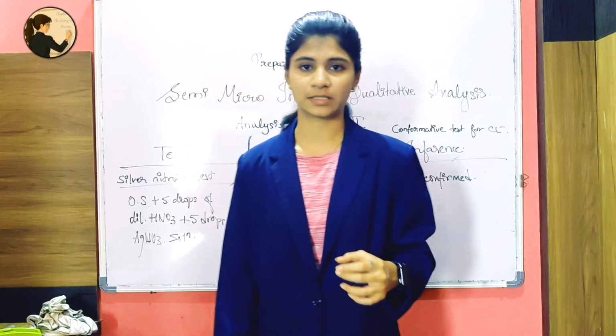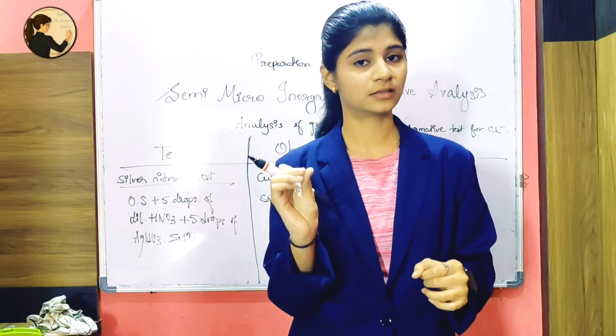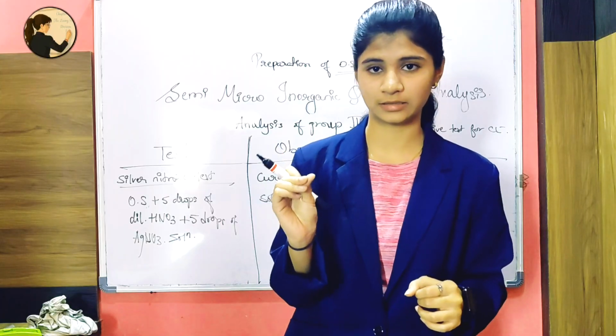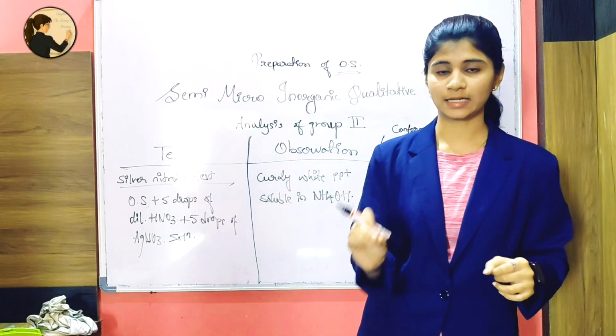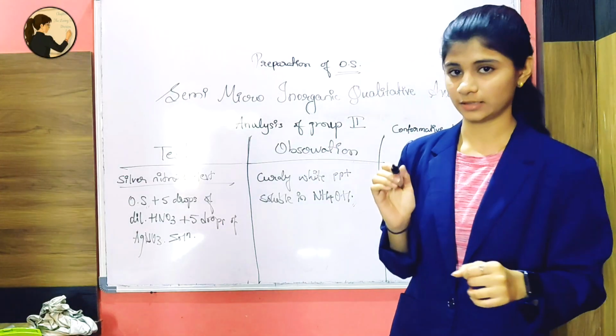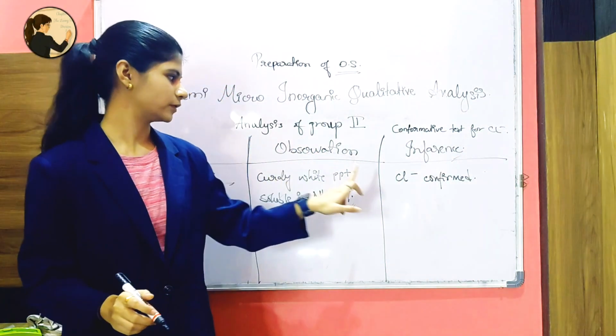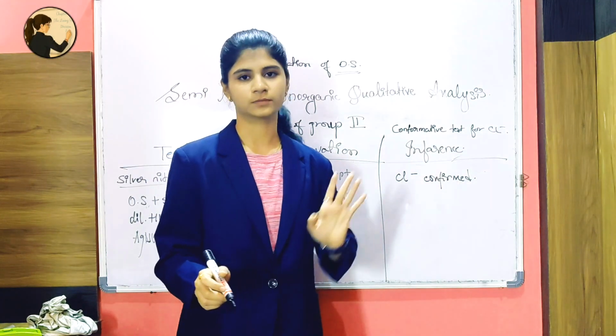The solution in the test tube will convert into curd, which you will be seeing. That type of PPT will occur in the test tube. So what will you write in the inference? In inference you are going to write Cl minus is confirmed.